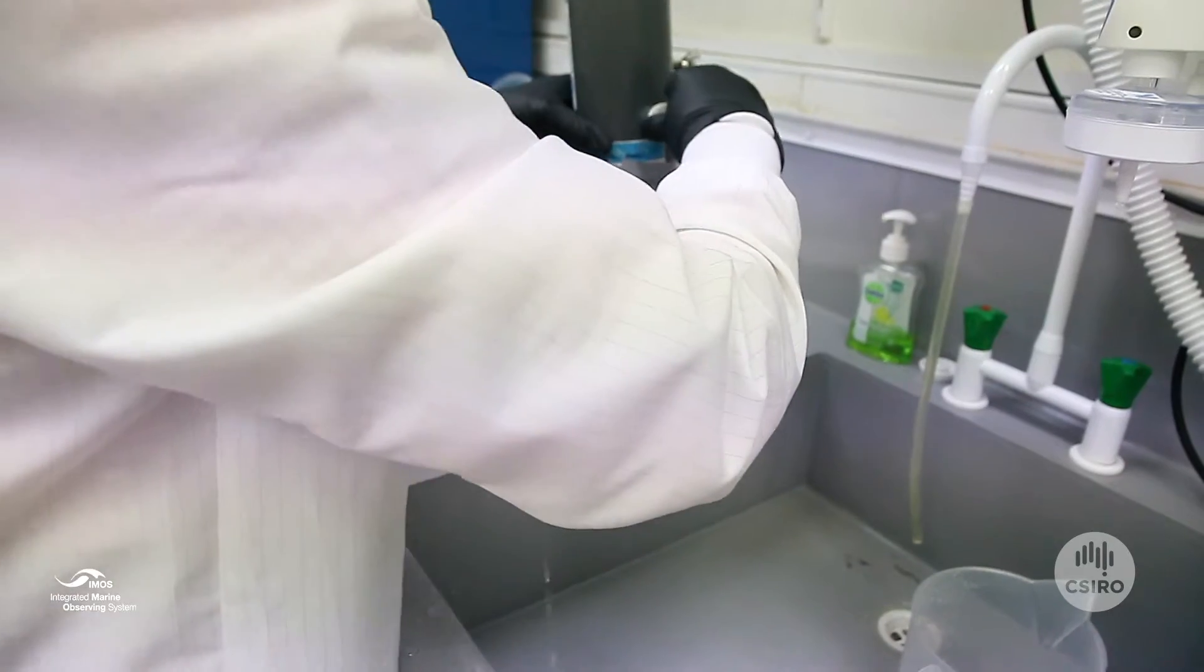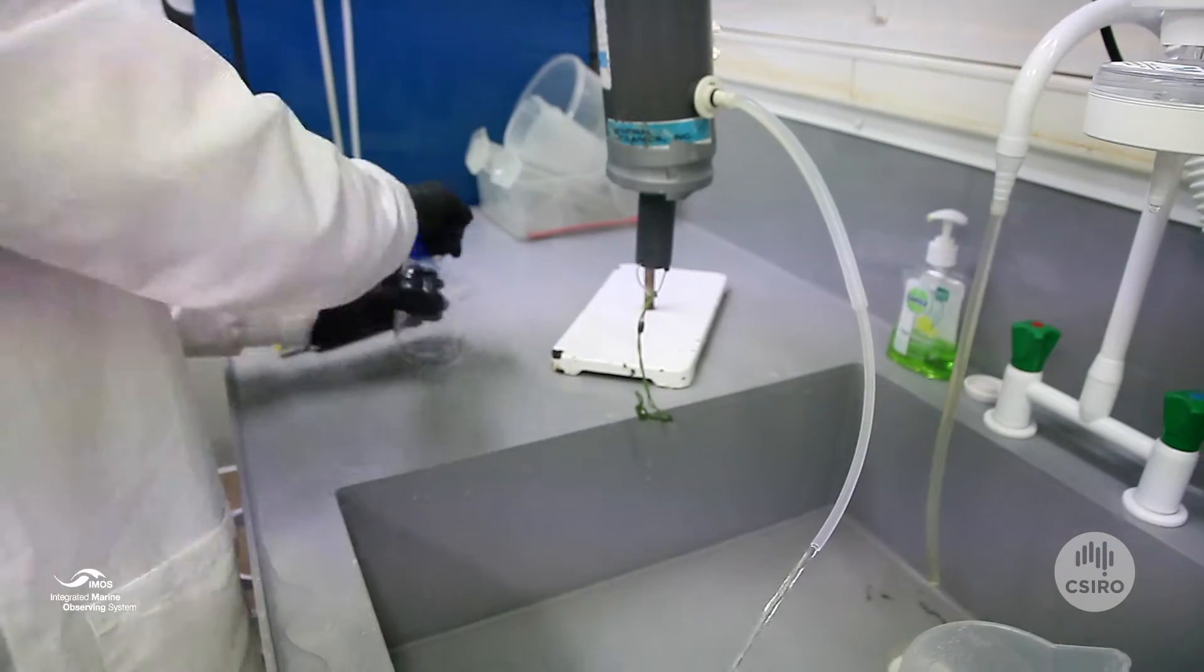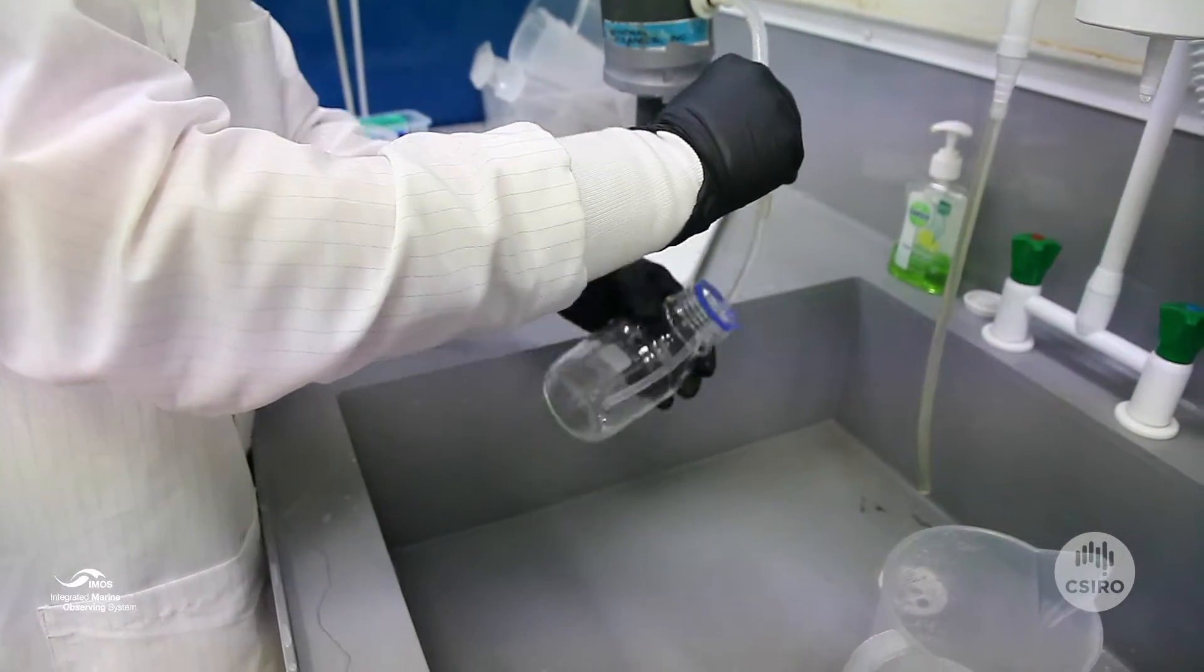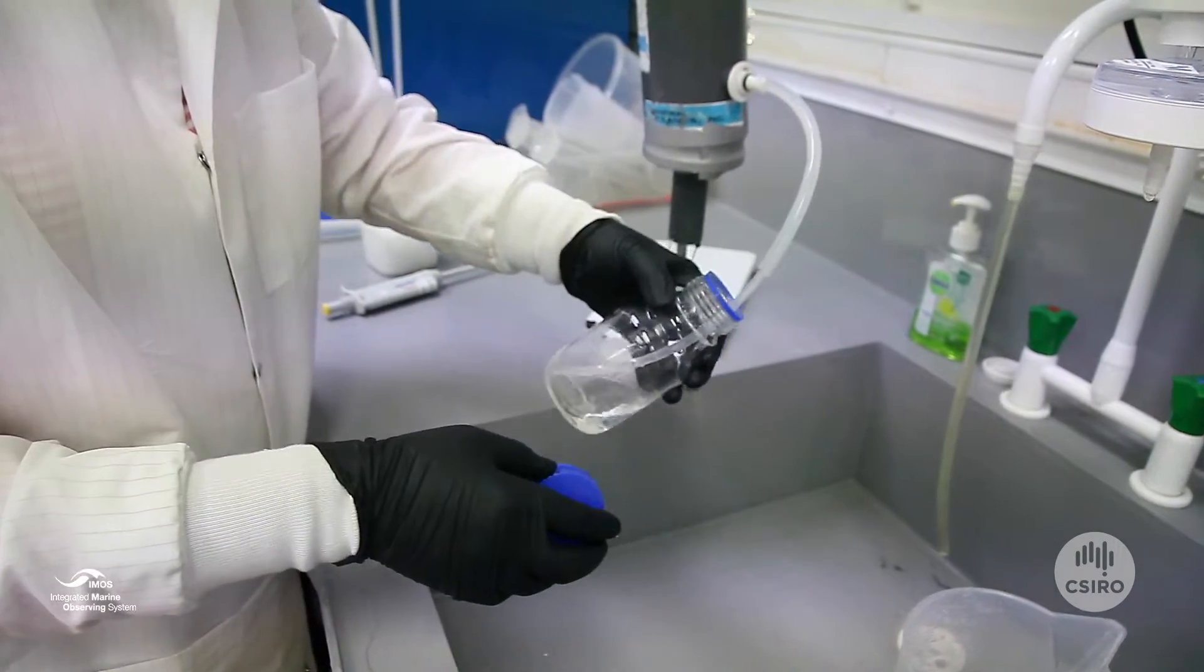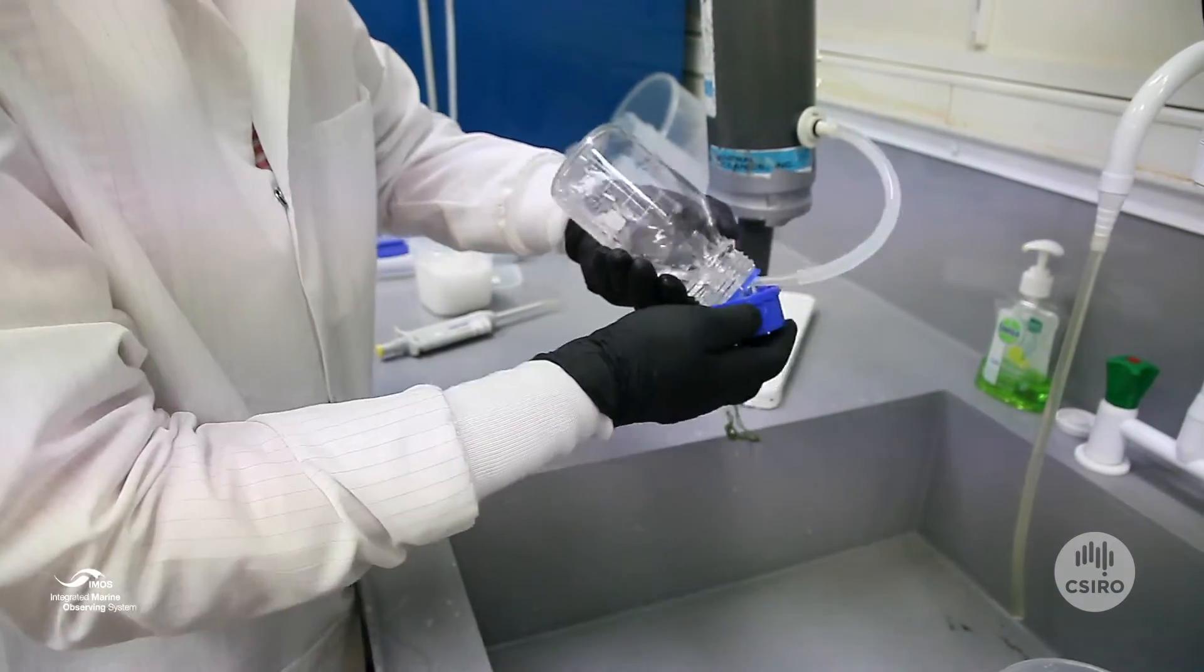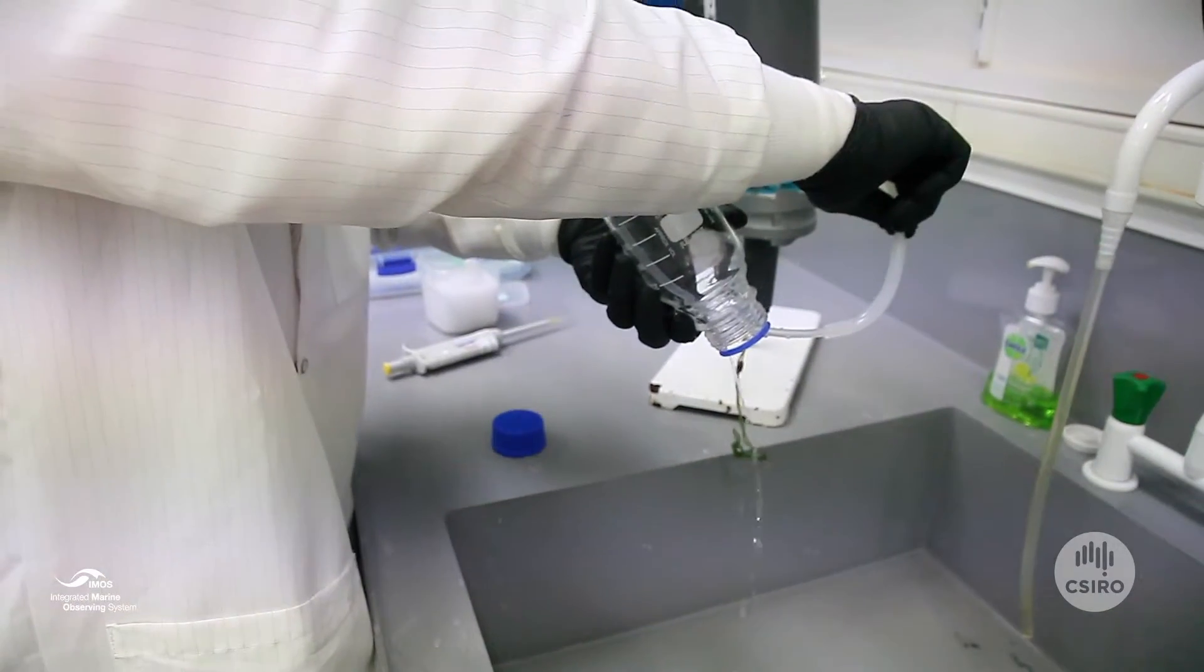The round bottles with the blue lids are for total alkalinity samples and they're taken in exactly the same way as the TCO2 samples. Start the flow. Rinse the bottle three times—once, twice, three times. Stop the flow.